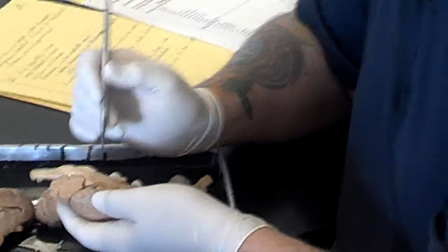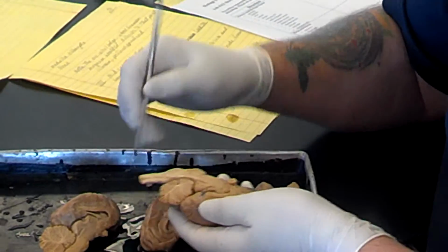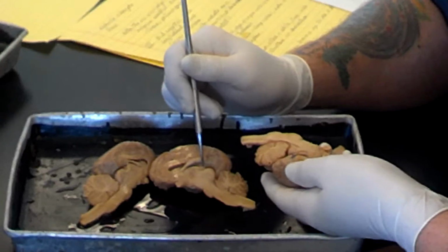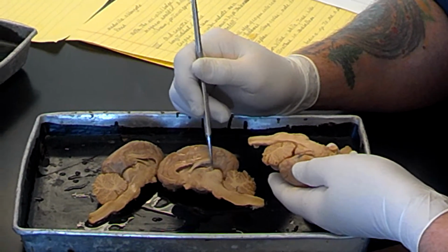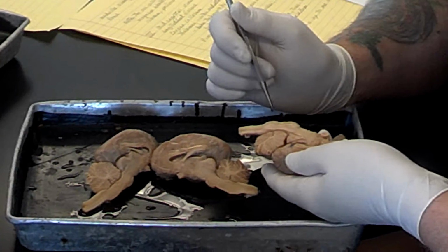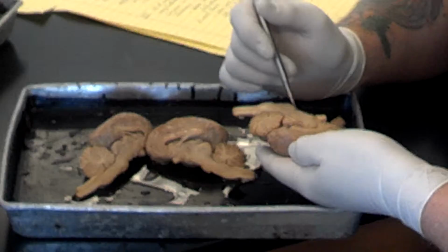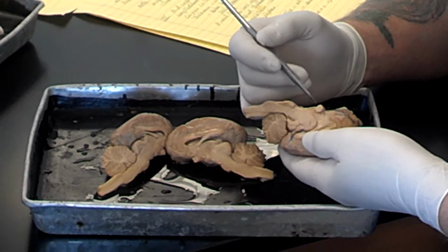Actually, you can see it on this one. This is the pineal gland right here. Now on these, you can see where it was. It's right here. It easily comes off. It's not very firmly attached. That's the pineal gland. Here's the optic chiasm.